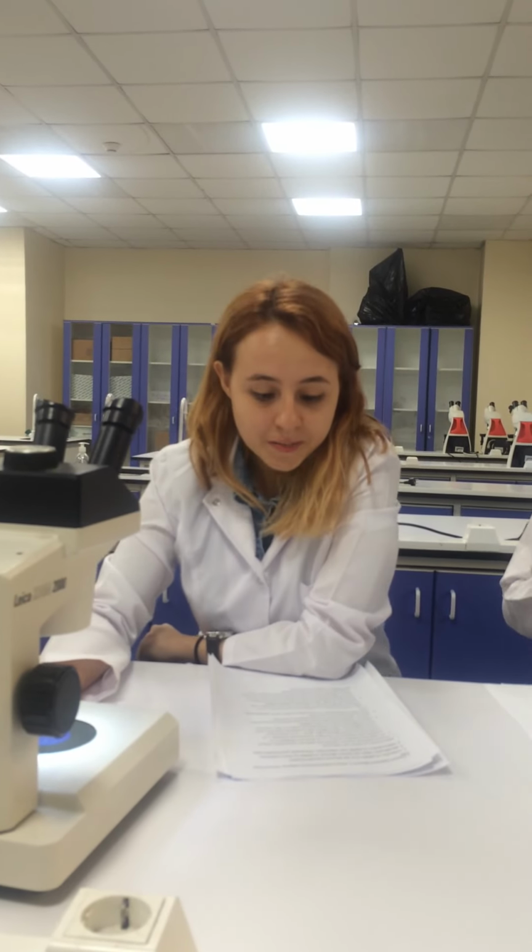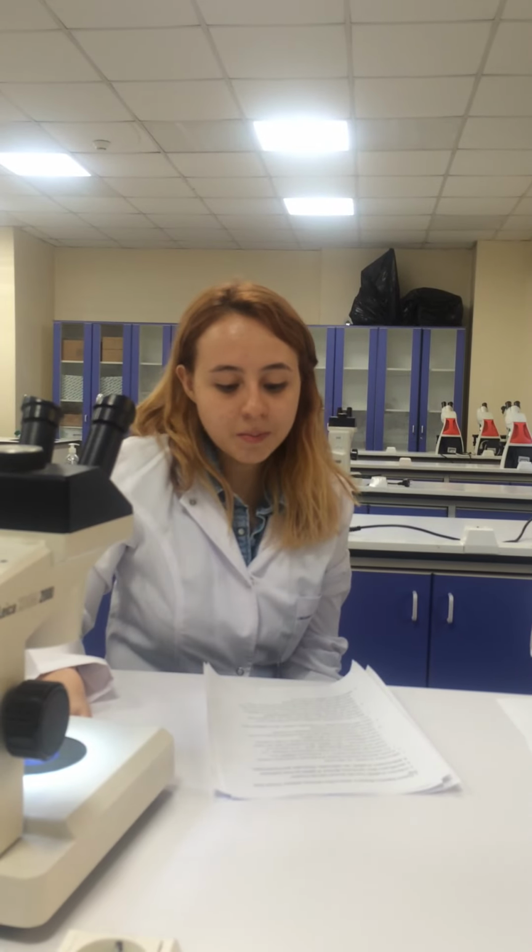And I will talk about the differentiation of porcine adipose-derived stem cells into adipocytes, osteocytes, and chondrocytes. The first step is differentiation of porcine adipose-derived stem cells into adipocytes. We first prepare adipose induction medium and adipose maintenance medium.